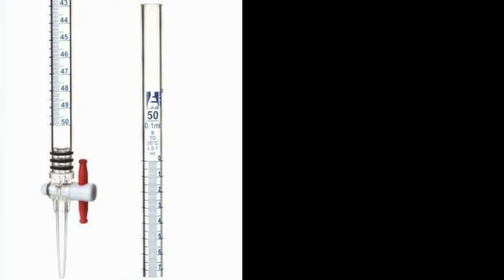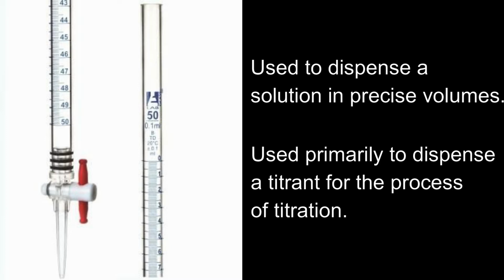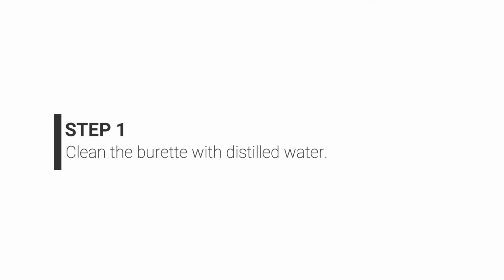A burette is a laboratory glassware used to dispense a solution in precise volumes. It is used primarily to dispense a titrant in the titration experiment. The first step in titration is to rinse the burette to make sure the burette is clean. Start rinsing the inside of the burette with distilled water.